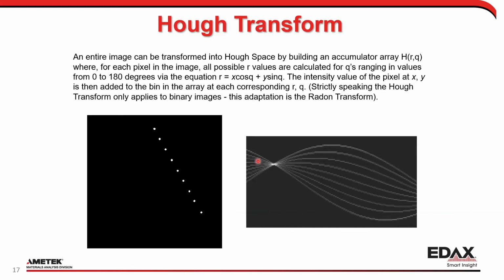Again, it's used from everything from LiDAR systems to, nowadays, they even use it for Tesla's car kind of things. They use this kind of transform to understand what things are by looking at the shape of them. Again, we use it to find lines. Hough transform can also be used to find circles or whatever else you want to find.